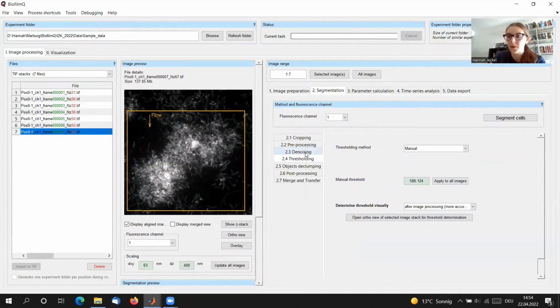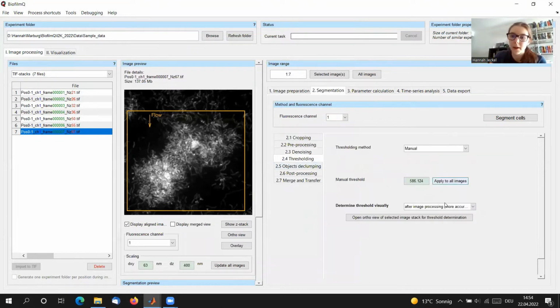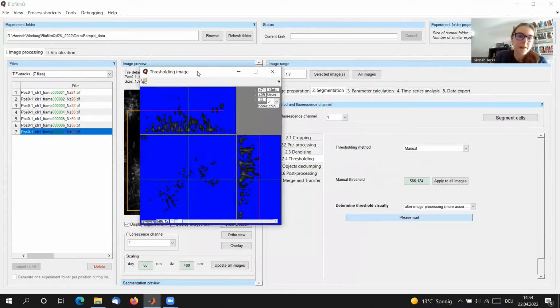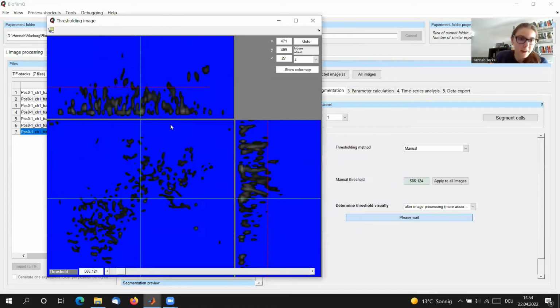But the other thing that I wanted to show you is the effect of the filters, right? So you remember what the image looked like before. What happens if we, for example, apply a much larger window of averaging? So if I do 11 and 3 here, for example, let's have a look at the effect that this has on the image. And now the same calculations will be run again, and we will get the same sort of visual feedback. But this time the filter that was applied is a filter that had this other thresholding image value.